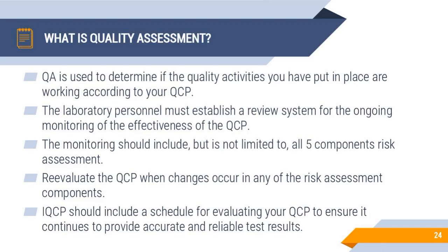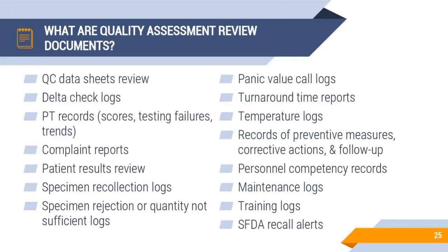IQCP should include a schedule for re-evaluation, when I should re-evaluate my IQCP. This is up to the lab's decision. What are the quality assessment review documents? What are the documents I should review? I have listed some examples that I can review to make sure that my plan is doing a great job.